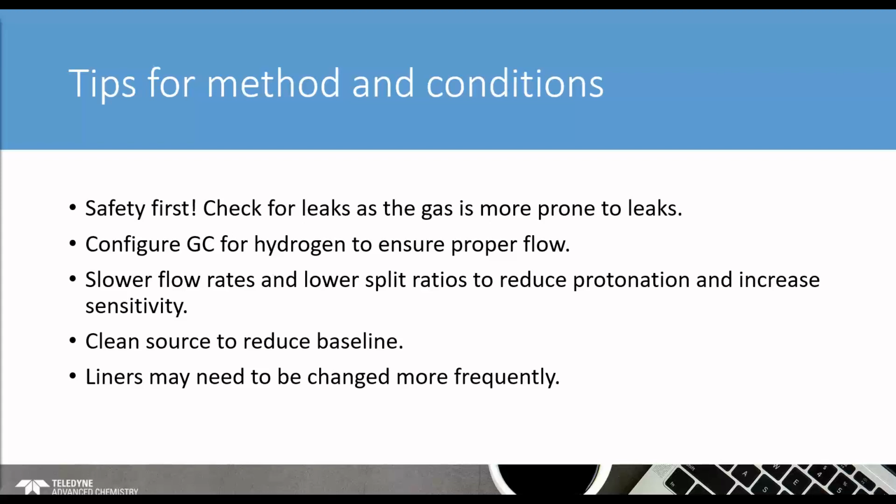First and foremost, safety is first. So be sure to check for leaks. Hydrogen is not only flammable, but is more prone to leaks and should be used with caution. Re-verify your GC gas types to ensure proper flow throughout the system.